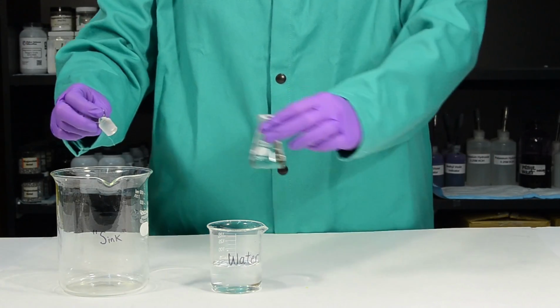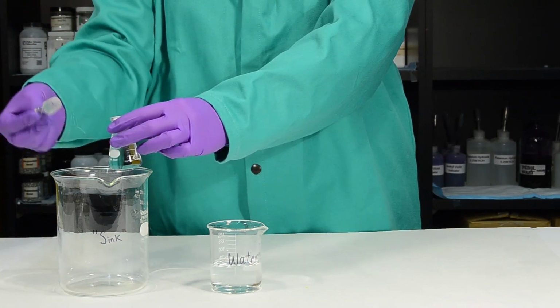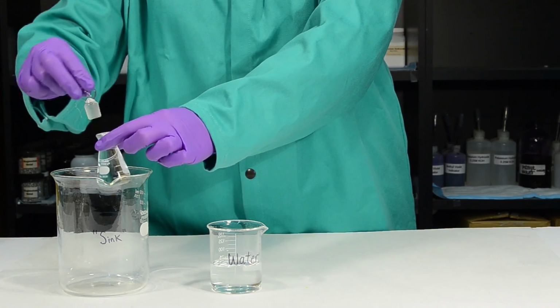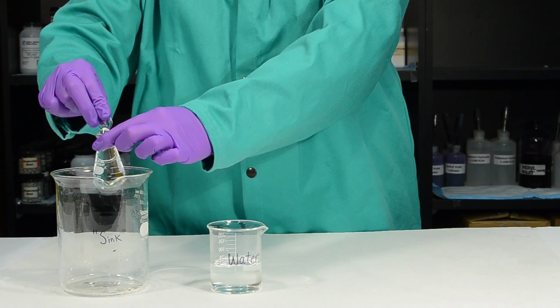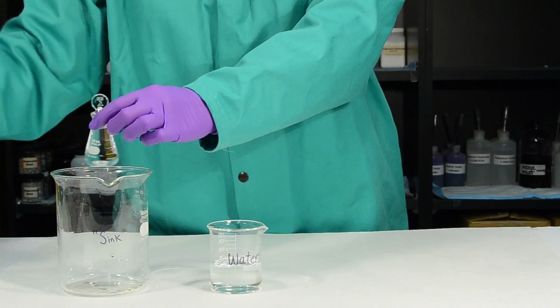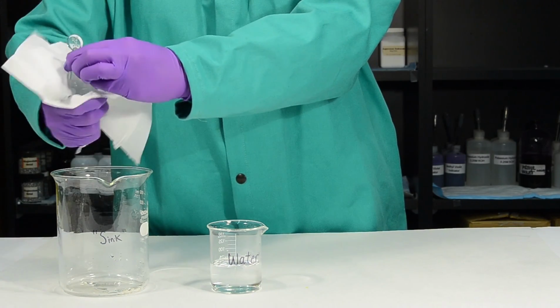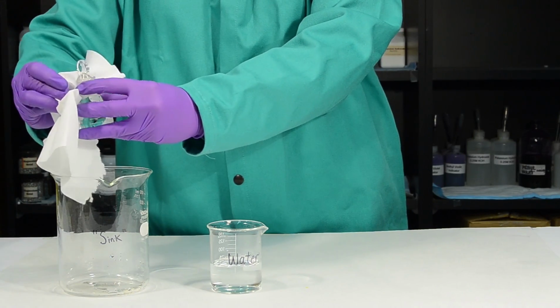Next, you should bring the flask to the sink. In this case, we're using a beaker to represent the sink, but you should actually go to the sink. And then you're going to insert the stopper into the flask so that the water displaced pours into the sink. Finally, dry the outside of the flask with a paper towel so that the mass of the water on the outside of the flask doesn't affect your results.